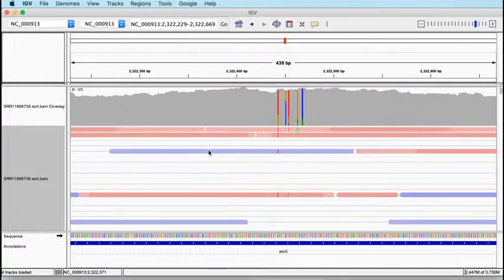This alignment isn't huge because it's against bacteria, but you can load in whole human genome sequencing data where your BAM file can be up to 100 gigabytes or even more, and IGV with some persuasion will handle those very large BAM files, and that is because of the index. That's why it requires the index, because what it reads is the index and then uses the index to extract only the reads for the part of the genome which is visible.